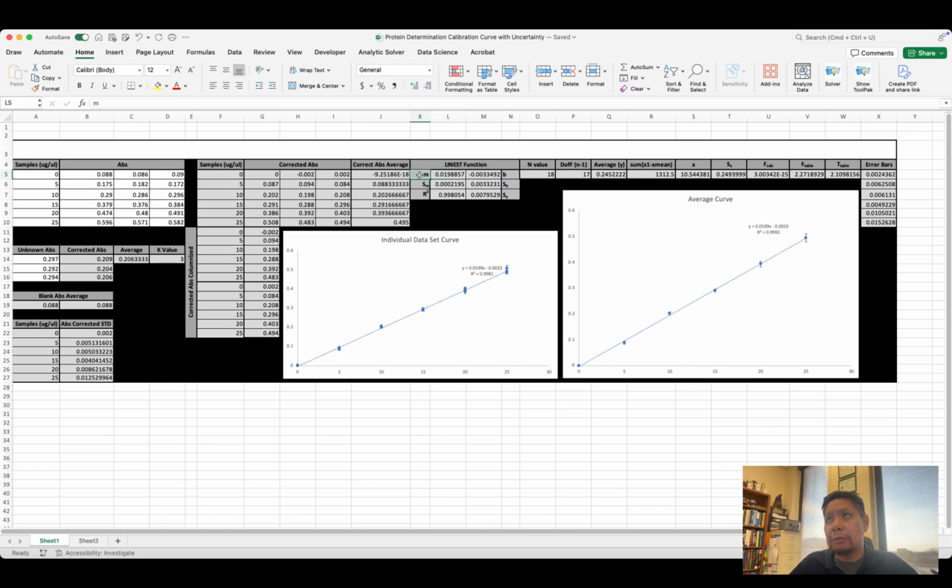And the first one is the slope. The second one is the uncertainty of the slope. The third one here is the R squared value. And then the one over here, the second one on to the right, is the y-intercept. And then the uncertainty of the y-intercept, and then the uncertainty of the y value itself, right? Which are not really helpful for us because we know our y's are not super uncertain because we decided what those values would be ourselves, right?